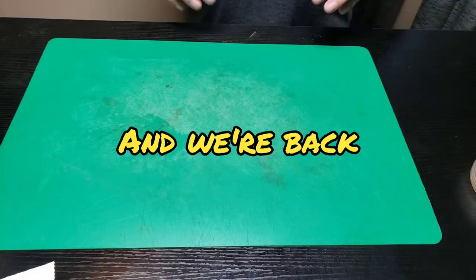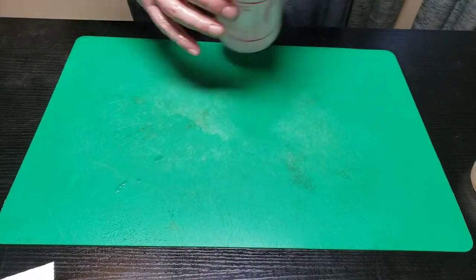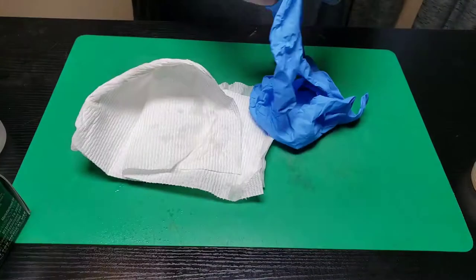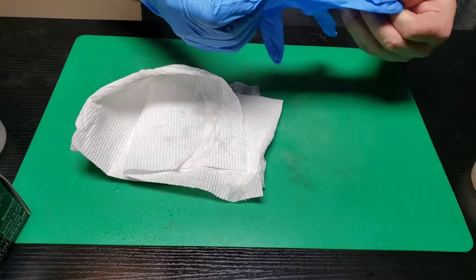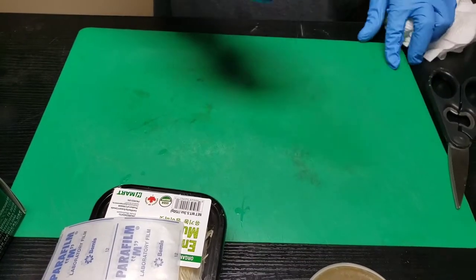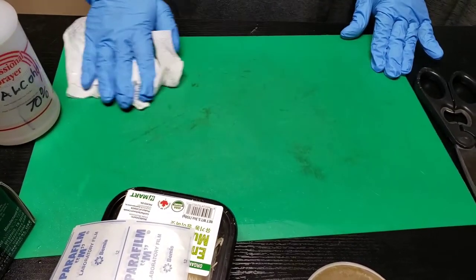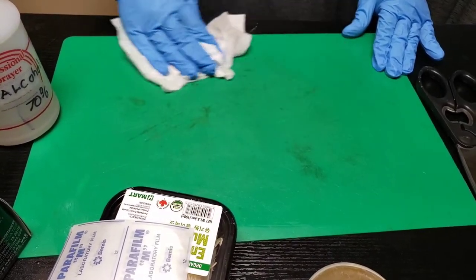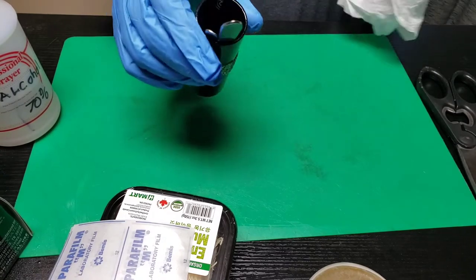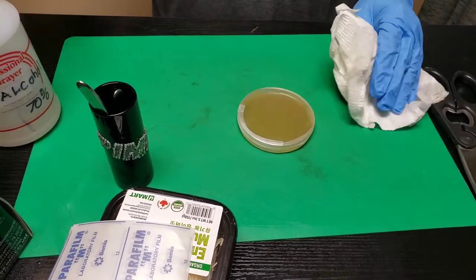First of all, I'm going to sterilize my hands. I did wash them very well, got underneath the fingernails. These aren't sterile but they will be after I spray them down with alcohol. I want to spray down my work surface with alcohol and wipe it down really well. I already washed and wiped it down. I also have a shot glass full of alcohol and our petri dish — I'm going to wipe and spray the outside of this really well and let all the alcohol dry off.